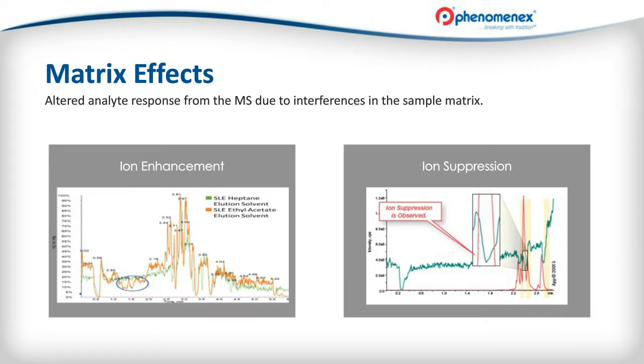This is just post-column infusion. What I mean by that is we are continuously injecting our analyte of interest into the mass spec, bypassing the LC column and the autosampler. At the same time that we're infusing this analyte into the mass spec, we are injecting an example blank matrix that goes to the autosampler, through the column, and then into the system. Since we are continuously infusing the analyte into the mass spec, we are able to see a continuous trace as opposed to a peak. This will allow us to find any regions of suppression that are caused by the blank matrix.